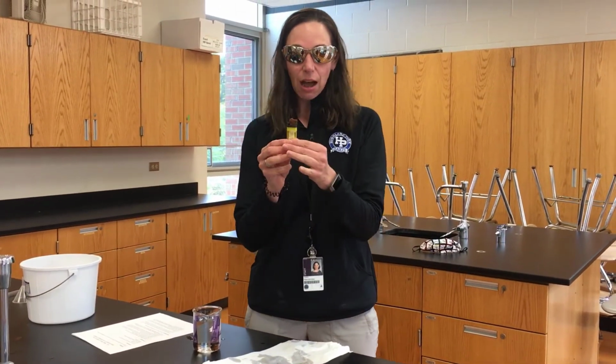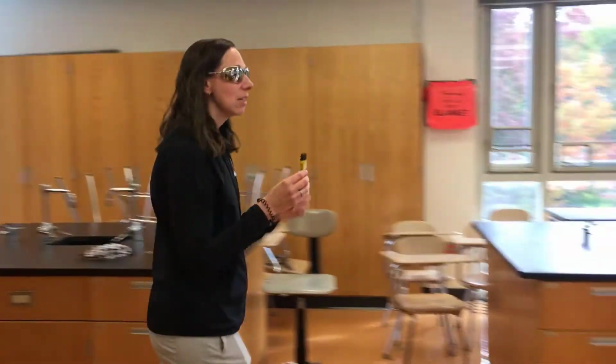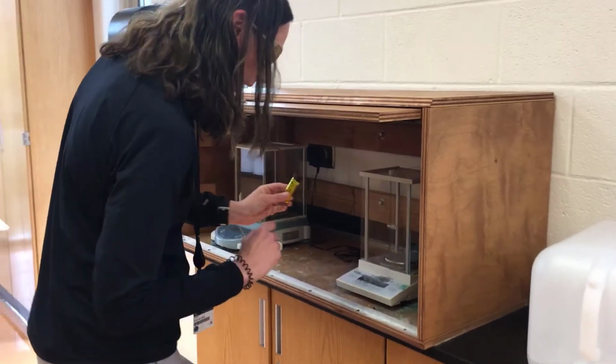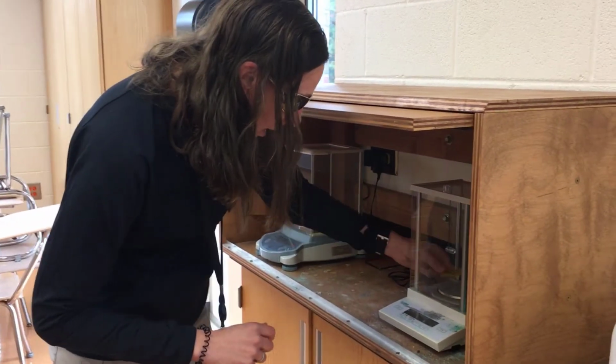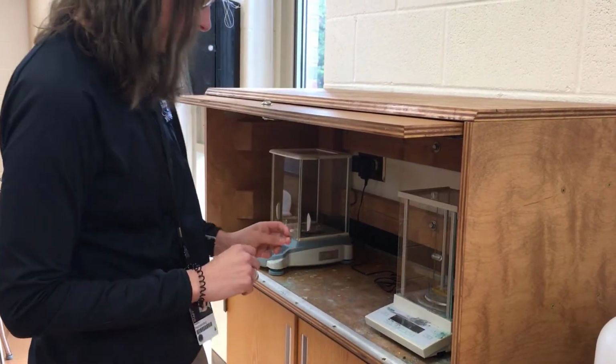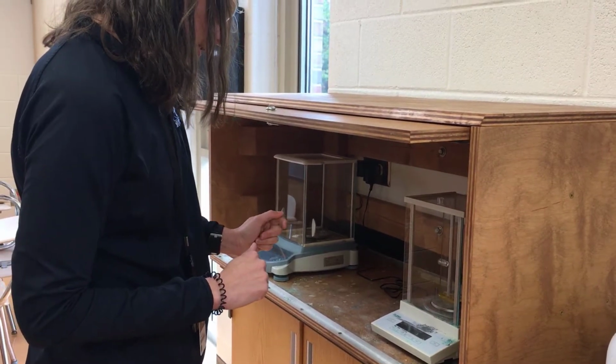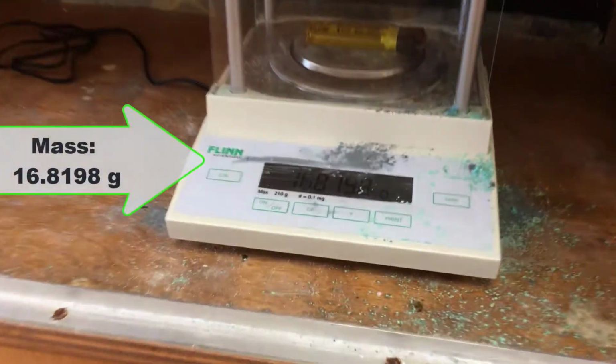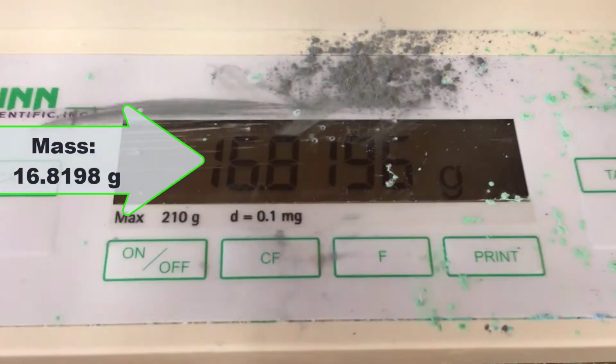So now that I've dried off the butane lighter, I'm going to take it to the analytical balance and tare it so it says 0. It says 0. And so we'll put this on here. And we are at 16.8198.